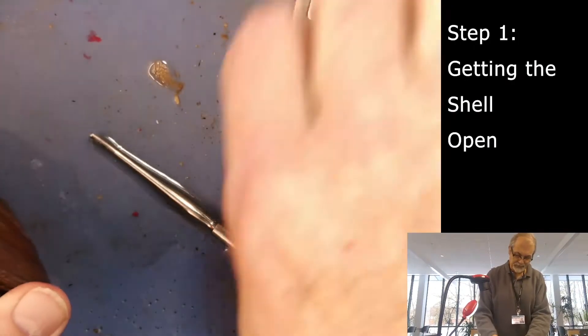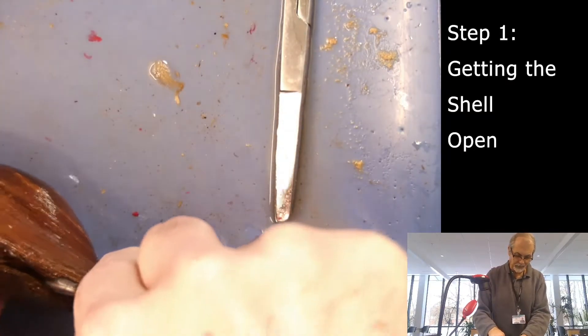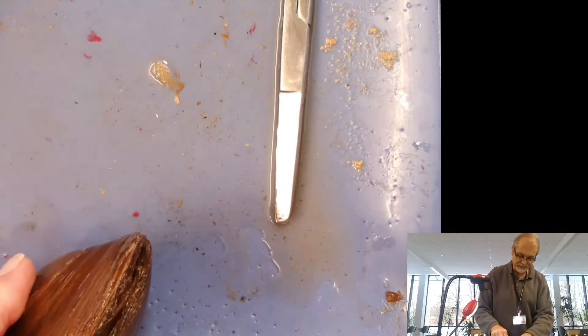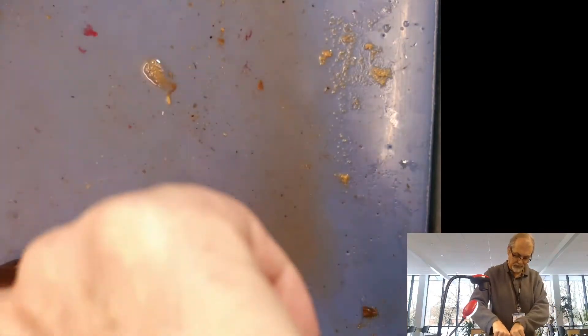Sometimes these open up perfectly — you don't have to do very much. They cooperate sometimes. You almost need a wedge. What you can do if you have to, you can actually cut the adductor muscle down in here, and that'll allow it to open. But I'm going to see if I can use two of these and wedge it open. It may work, it may not.